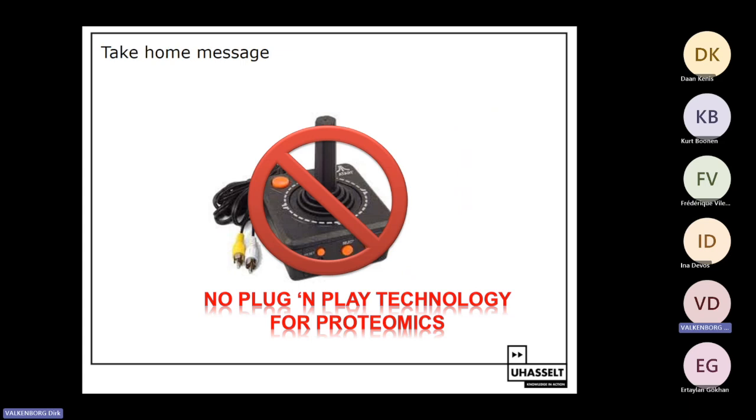So again, with this additional information, we now have the intensity of the fragment ions that come to work and will tremendously help us to set up more stringent searches. If we have a stringent search, we can also open up our search space and we can start to ask ourselves the question, do we still have to work with these canonical sequences?